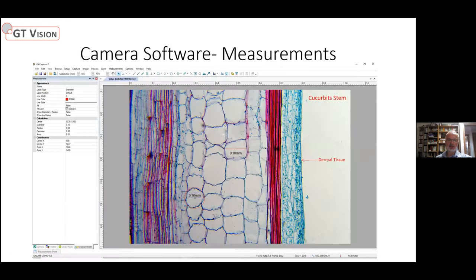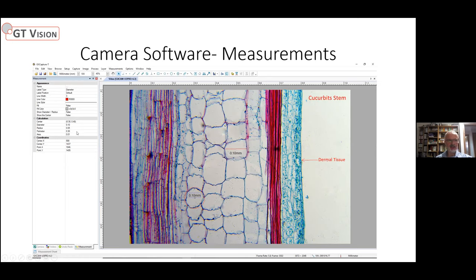A third software feature is measurements. You can add annotations — for example, this is a cucurbit stem section — with arrows identifying parts of the image, and labels like 'dermal tissue'. You can draw a line to measure a dimension, such as 0.1 millimeters, or a circle showing a 0.1 millimeter diameter. There's a wide range of measurement tools including rectangles, ellipses, concentric circles, right angles, and arcs — so you can measure length, diameter, radius, perimeter, and area.